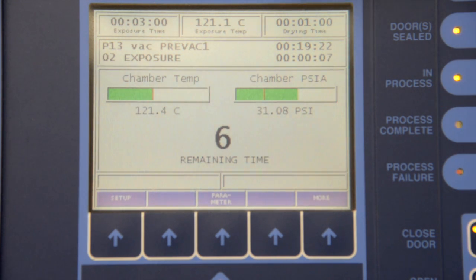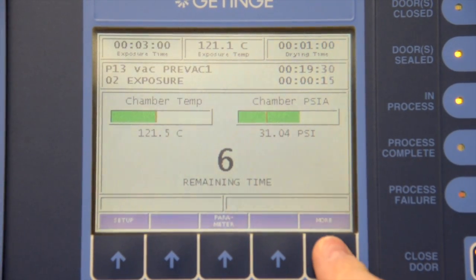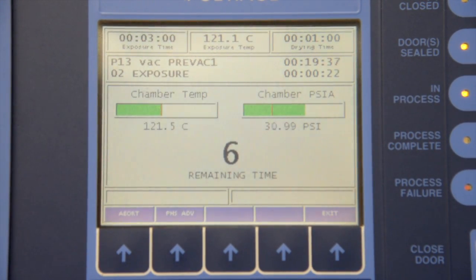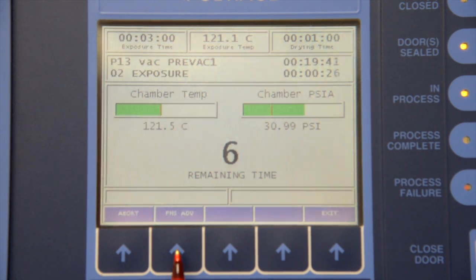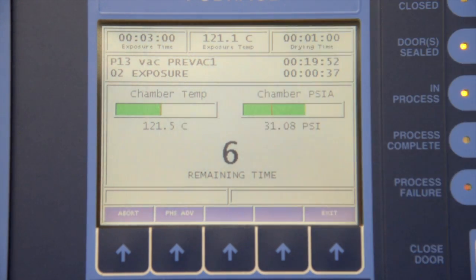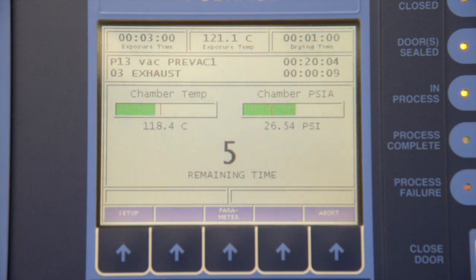We've now gone into the exposure phase. The exposure phase is the time your load remains at temperature for the amount of time you selected. Phase advance can only be used when the phase is a timed phase, such as exposure. We have a three-minute exposure, therefore it's timed and we can phase advance. Pushing the button skips to the next phase — you can see the cycle advanced and we've gone into exhaust. Exhaust is not a timed phase because we're simply decreasing the amount of pressure. The abort button is now available and we did not have to select another button to reach it.